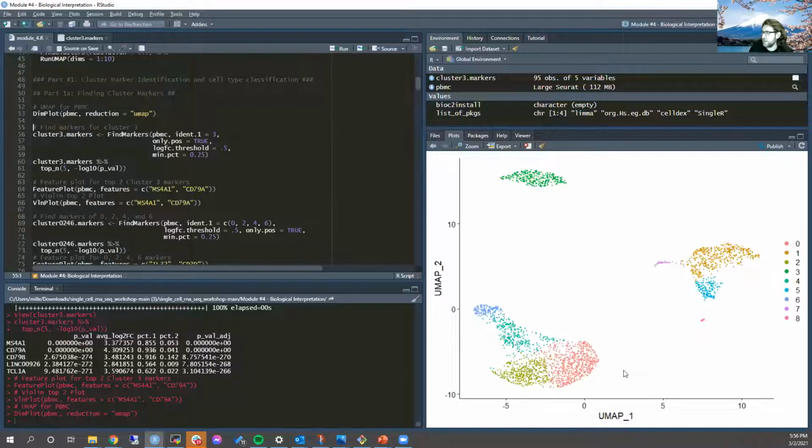This gives us the idea that when we're looking at single cell data, it's very helpful for interpretation to see both the embedding and the clusters in one visualization, because they can each tell you things that the other can't. We might want to ask the question now: clearly there's something about these 4 clusters, 0, 2, 4, and 6, that is shared. They have something in common that makes them different from all the other clusters in the embedding. So let's see if we can figure out what genes are expressed in all 4 of these clusters compared to everything else.